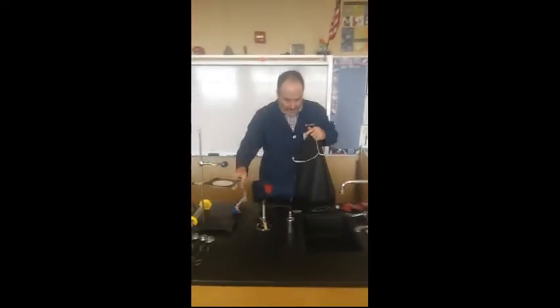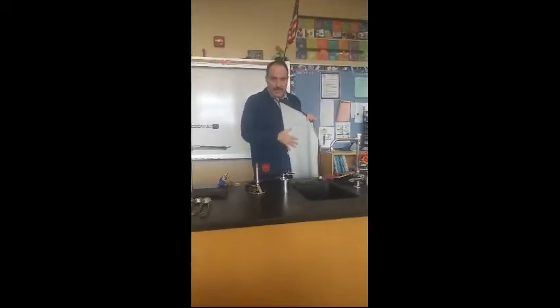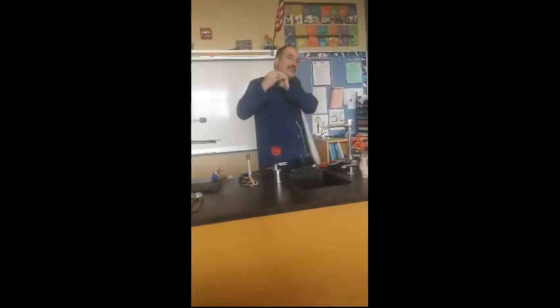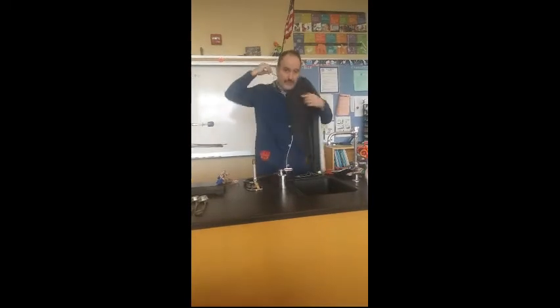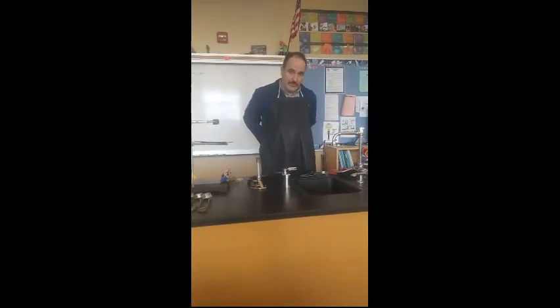Now your lab apron and goggles look like this. All right, they look like this. Now when you're wearing these, all right, you want to make sure that the white side is on the inside. It goes over your neck. If it's too long or too short, you can either tie or untie a knot here in order to adjust it. But when you're doing it, you also have to make sure that these are tied behind your back.